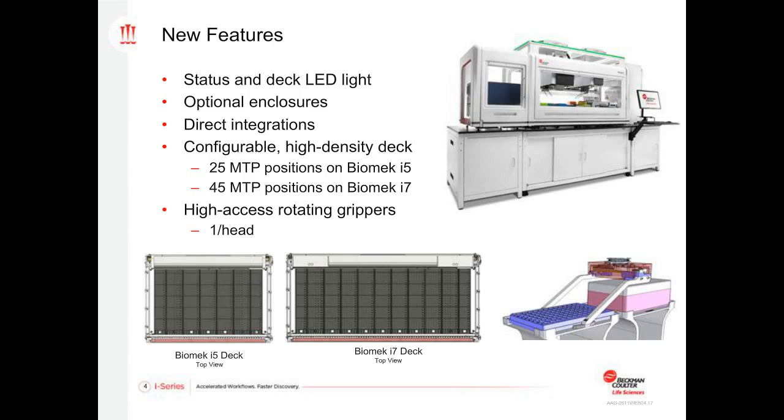This allows complete coverage of the deck so that all positions can be accessed. And because of the high access, you can also pick up a microtiter plate next to a taller piece of labware, such as a tip box. There's one per head, so if you have two heads on the system, you would have two grippers.